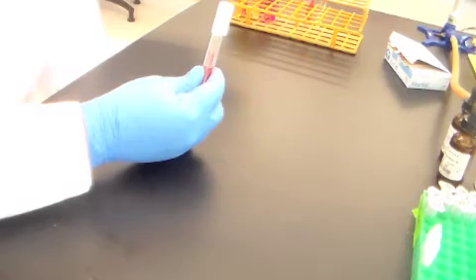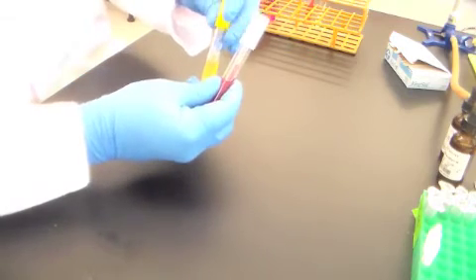And again, this particular bacterium utilized this other carbohydrate, sorbitol. It fermented that sorbitol very well and produced gas in there. And so sorbitol is an important diagnostic test used in microbiology. So the interpretations of your carbohydrate fermentation tests are very simple and very straightforward. The same with the other test that you inoculated.